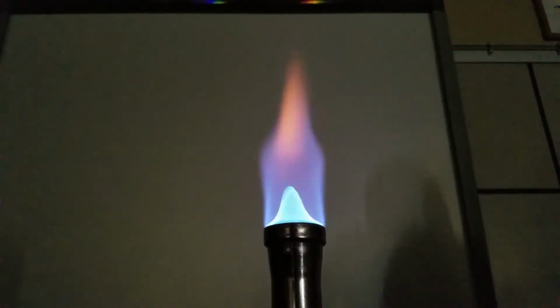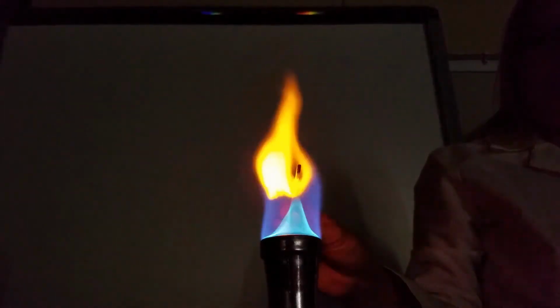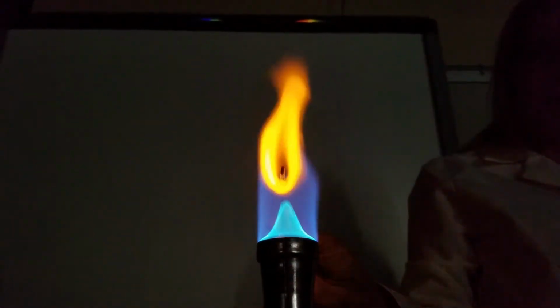All right, the next one is calcium chloride. So wait for this to get going a little, and you can again see how that flame color changes. Record your observations for calcium chloride.